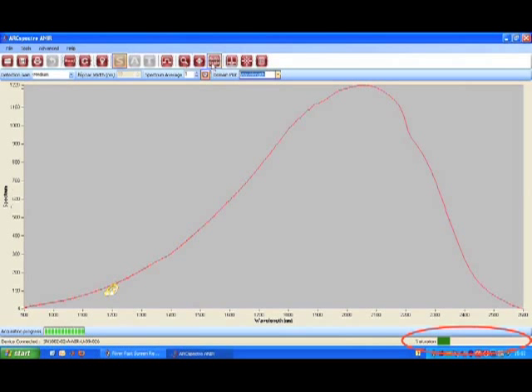As you can see on the saturation bar, which turned green, the signal is now higher, but not optimal yet.